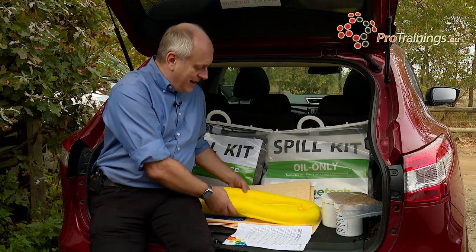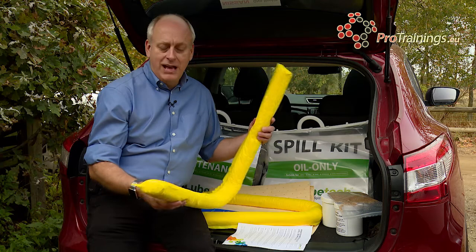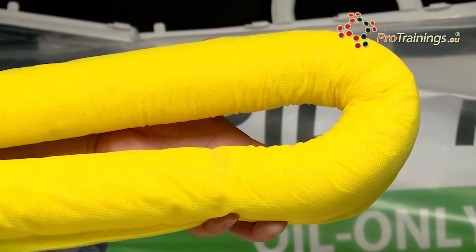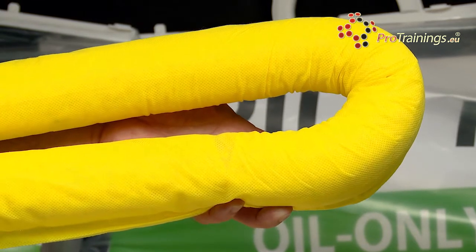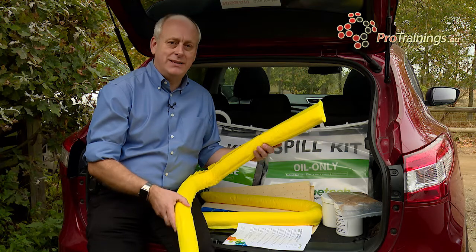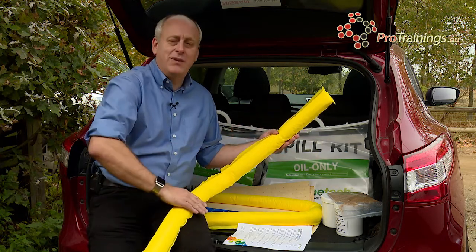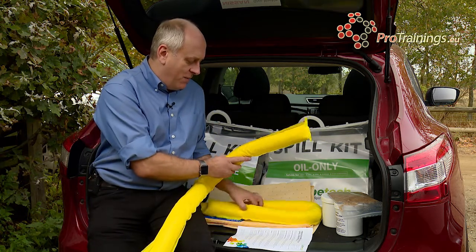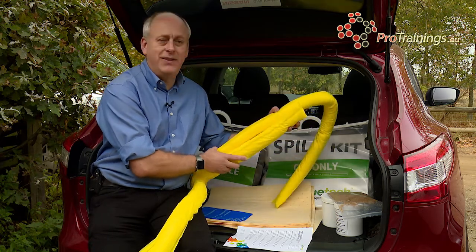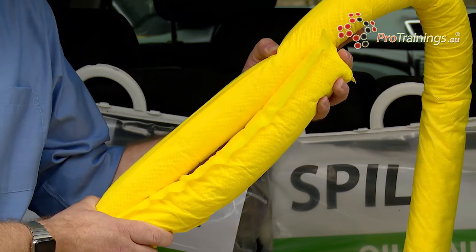The first component inside here is a basic sock. If there is a chemical spill and you want to hold it within a set space or divert the spill in a different direction, this is what you use. It is very lightweight and has very high absorbency, so as the chemical flows you can move it to redirect the spill. You can join two of these together — it is recommended to overlap them by about 30 centimetres.